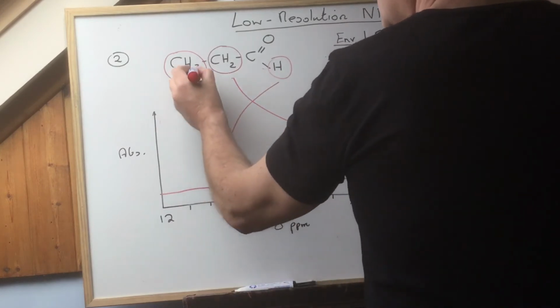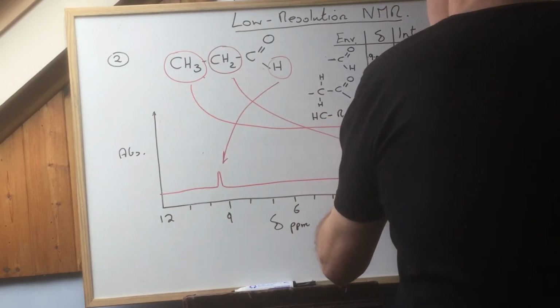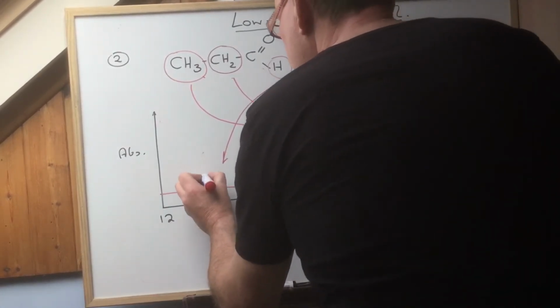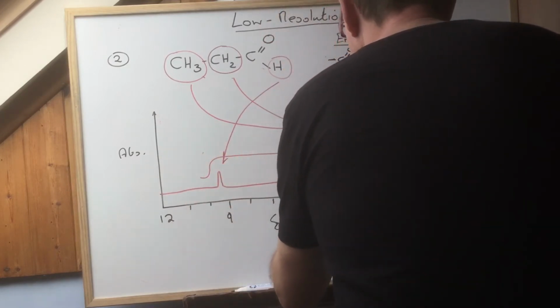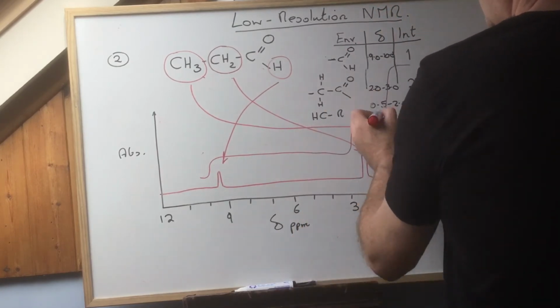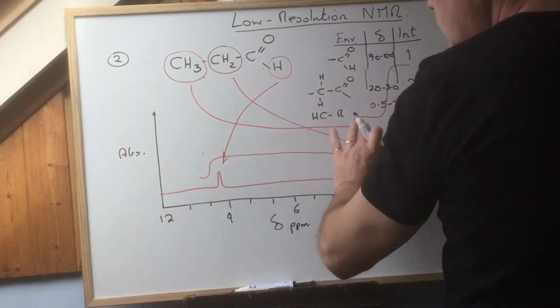Those 3 there are right on the left hand side, on the right hand side there. Okay, now integration would look like this, overlaid with some mathematical stuff. Oh dear. Right, and you are going to get on there. They are supposed to be relative heights. Don't worry, it's a mathematical process.